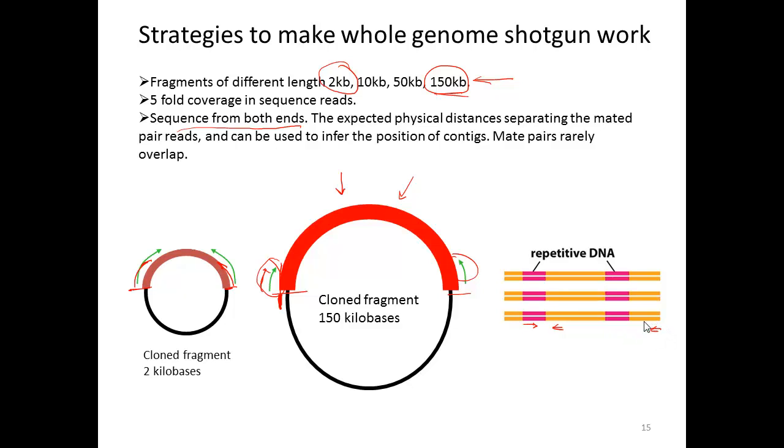Then as you start to assemble this sequence, and you know that these two are linked, when I find the piece that goes here, I'm going to have on the other end the piece that goes here. So by working on one end, you're able to position correctly or anticipate that there is repetitive sequence here and not get fooled.